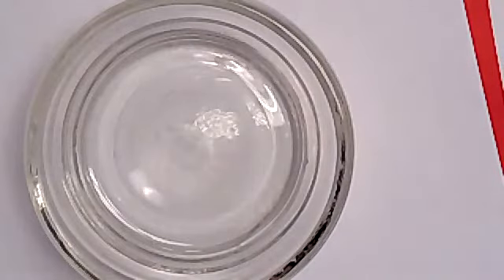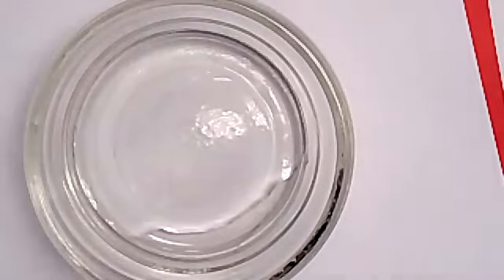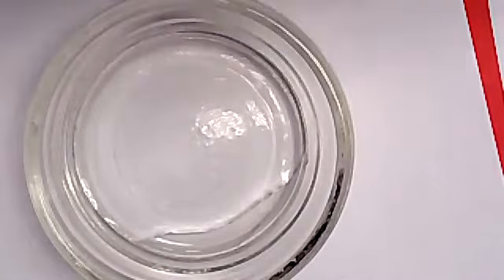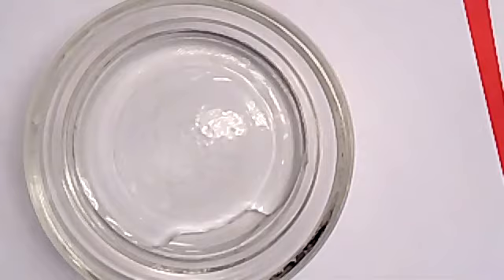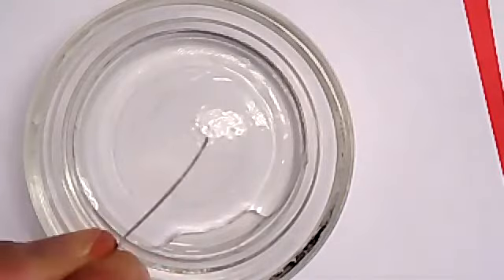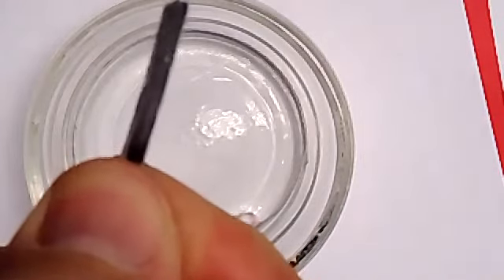Our next one is going to be the hydrochloric acid and magnesium. Hydrochloric acid is the same kind of acid that is in your stomach when you digest food. It is also a clear solution. And magnesium is a metal. And I have a small piece of magnesium right here. I can show it to you here. Very, very thin metal. It's kind of a dark gray in color.